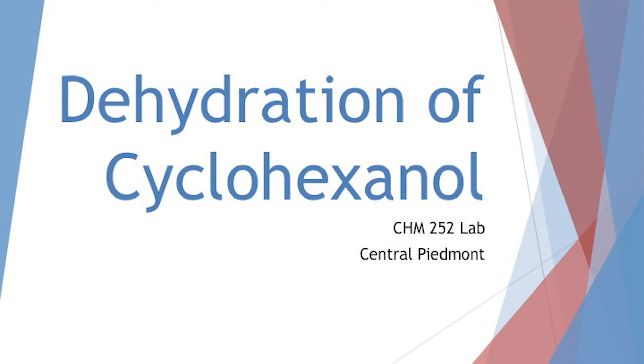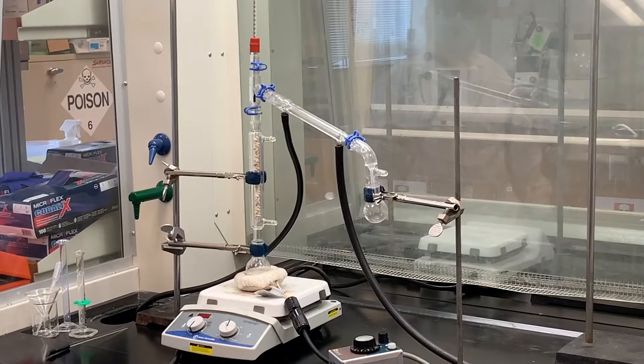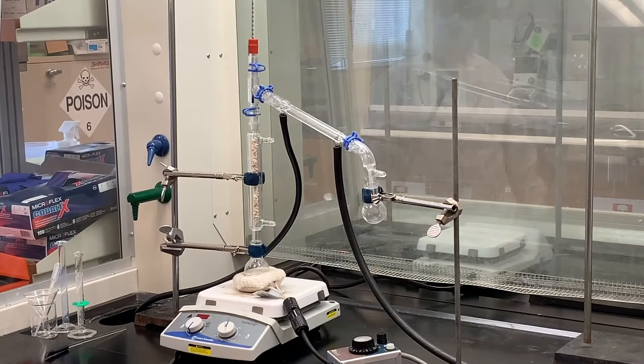Today's lab, we are going to dehydrate cyclohexanol, which is a secondary alcohol, to form cyclohexene, which will contain the carbon-carbon double bond, so an alkene.